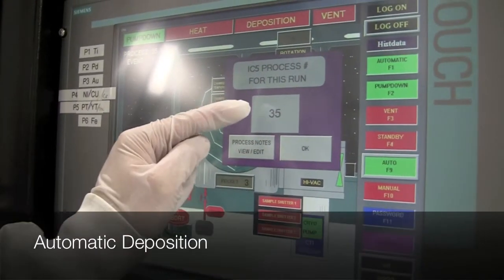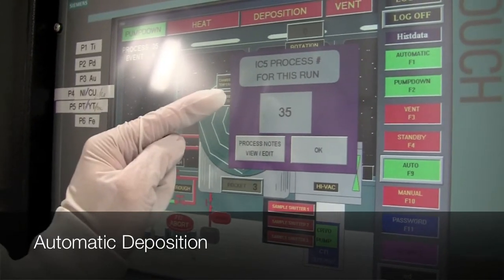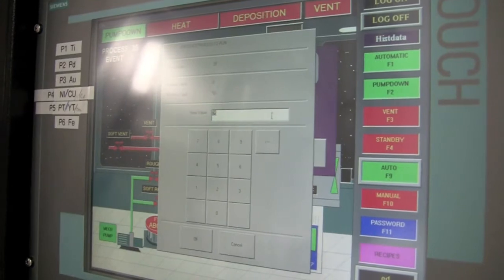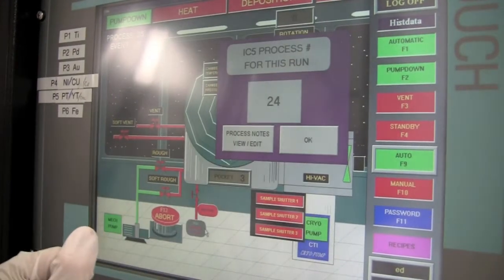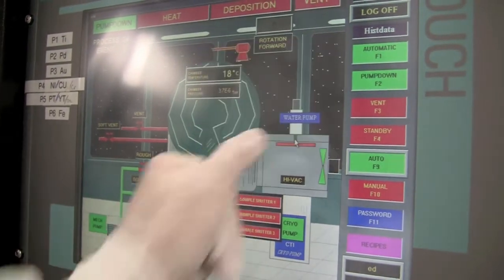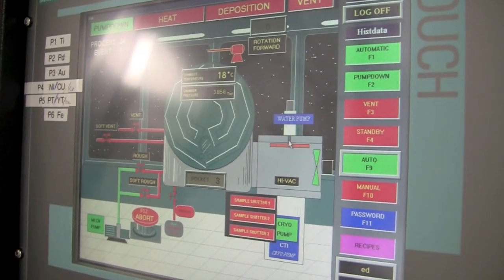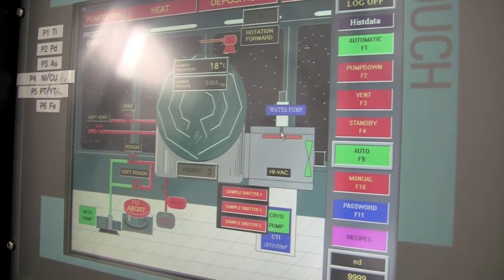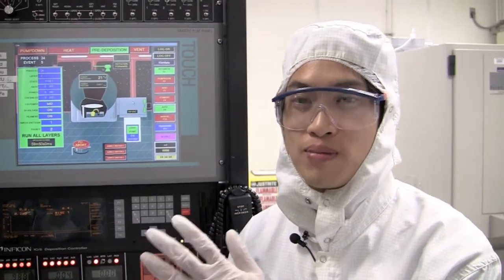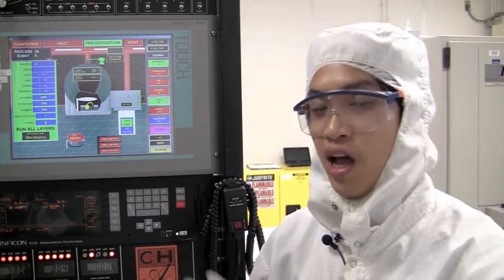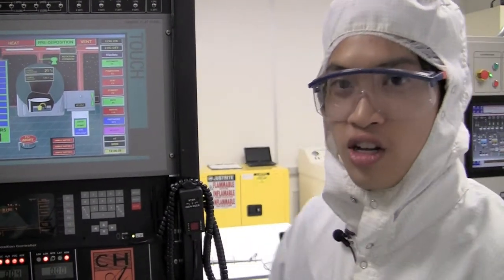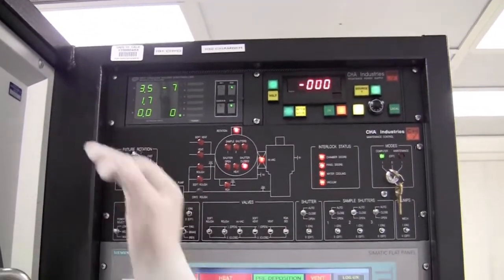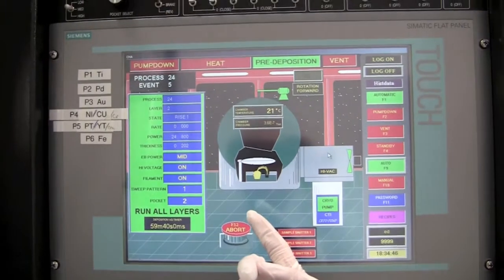You can see that the recipe that's loaded is number 35. I mentioned that I'm trying to run recipe 24. To change this, I'll click the number and input 24 and do OK. Once I push OK, the tool will automatically continue pumping down until it's reached its deposition pressure. Once the chamber pumps down to 10 to the minus 7, the deposition is going to automatically start. So we can verify the pressure from the ion gauge here. And then we can see that the graphical user interface goes into a deposition mode.